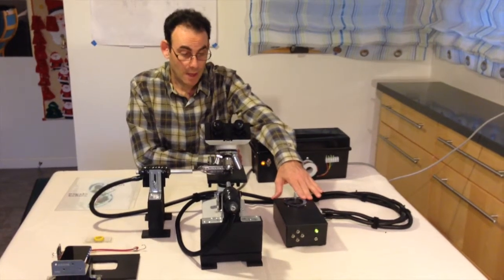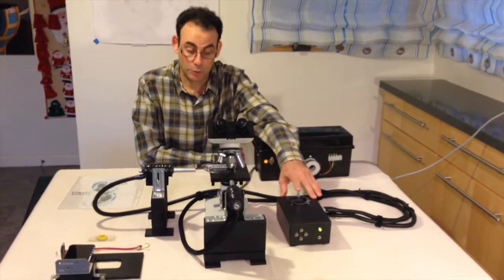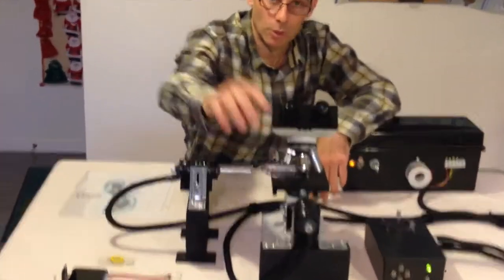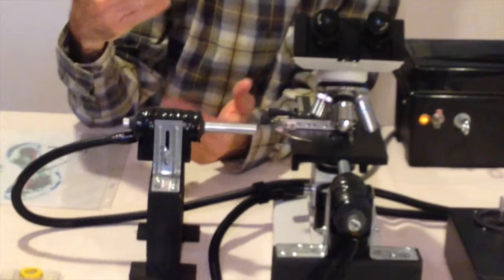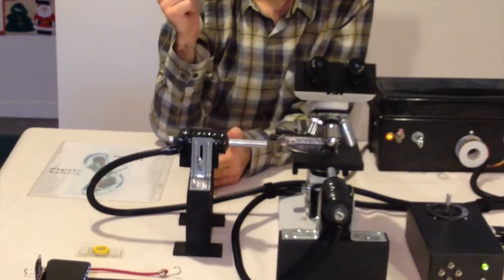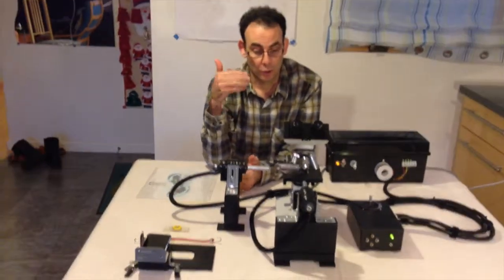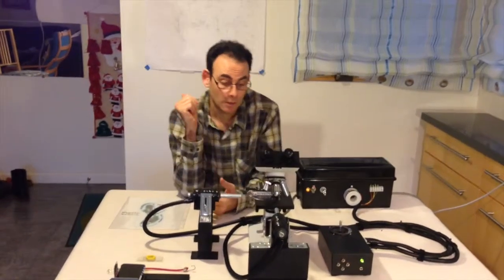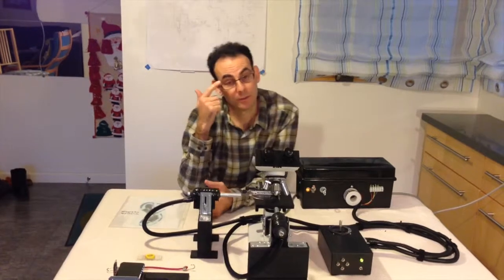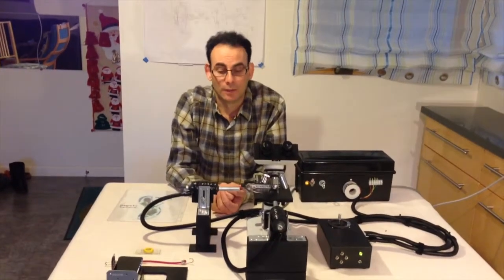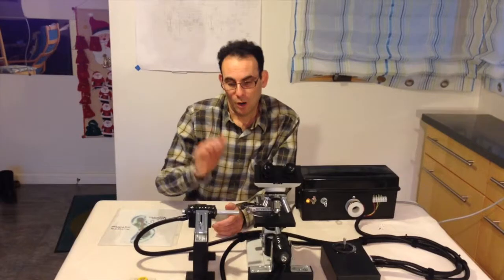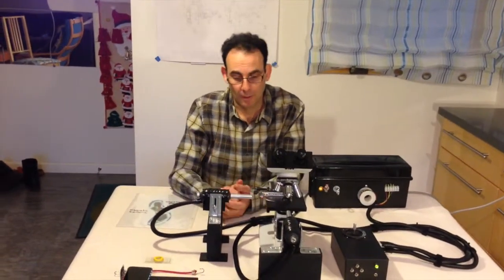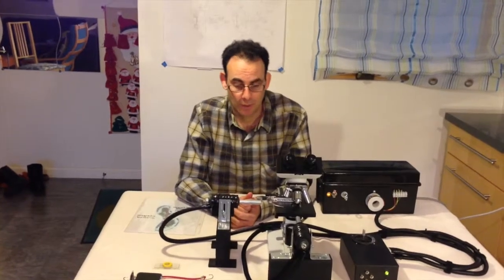The amplified signal from the joystick goes out to these two electromagnets. They're at right angles with respect to each other so that they control a magnetic field component in the x direction and the y direction. The sum of those vector components gives you a magnetic field in any direction.